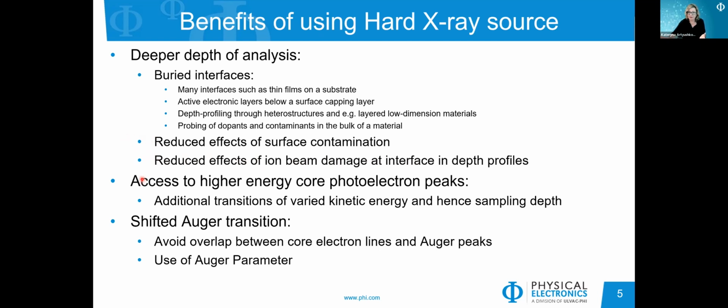Due to having a higher energy X-ray source, we now have access to higher-energy electron peaks. So now we have additional transitions that are accessible, and they come, of course, with additional chemical information, but also sampling depths that can be varied from one transition to another.